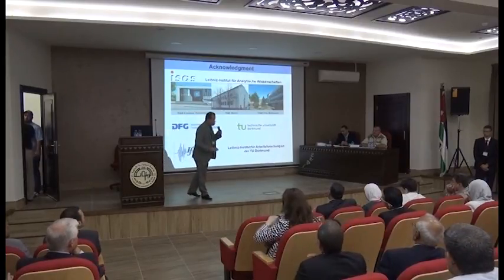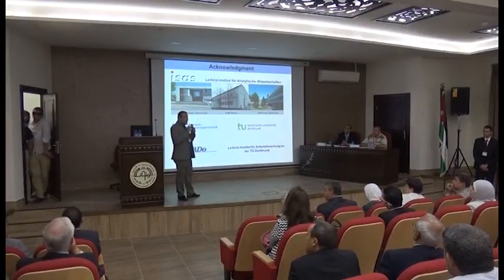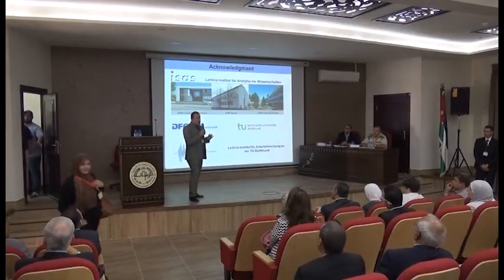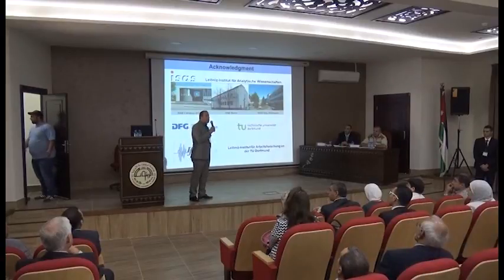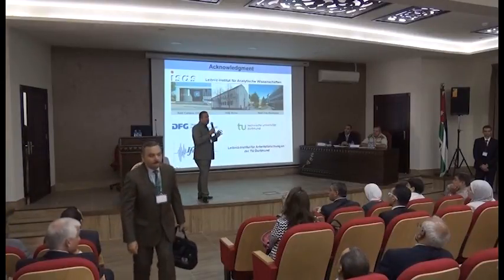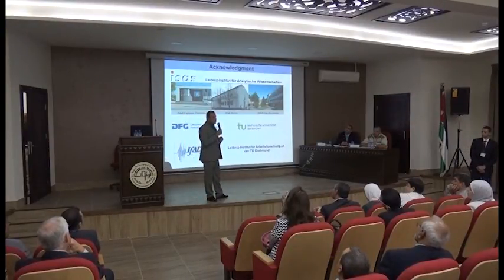I mentioned the lactate as an example. We are actually able to analyze 150 different metabolites. And to the first question, it's very important that there is now equipment available, not in my group, but I know they are working with NMR and mass spec combined together in one device. And in my group, we are also trying to combine IR, FTIR, Raman with the NMR. So there is now research in this direction. I know one group with Professor Bayari from the USA, we will maybe have, I hope, cooperation, because he is able to study single cell analysis by IR, and we try to combine it together with our group.